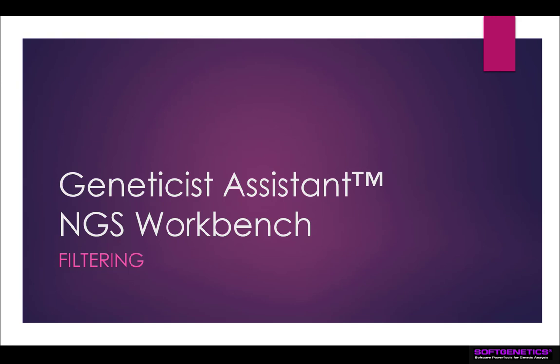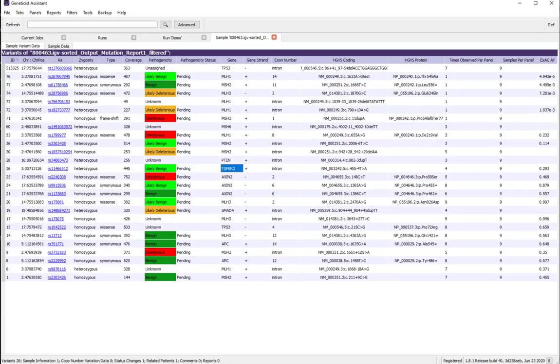We'll cover creating filter settings, saving filter templates, and applying the filters. We'll use the sample variant data table on the Sample tab as the example for creating filters. A similar process can also be used for filtering on other tables.